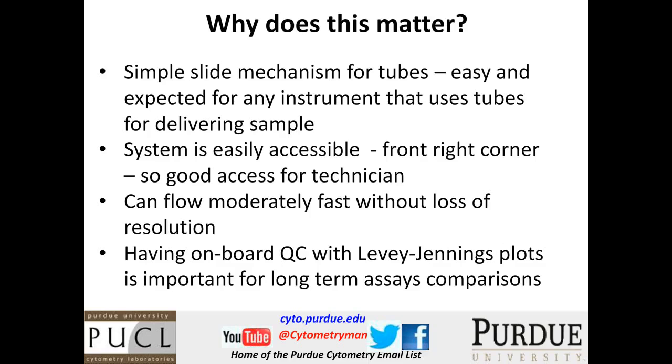And you can flow moderately fast without loss of resolution. I might actually change this to very fast or extremely fast. Moderately is probably far too conservative a word there, but it definitely is very, very fast. And having onboard QC, etc., will certainly help you.